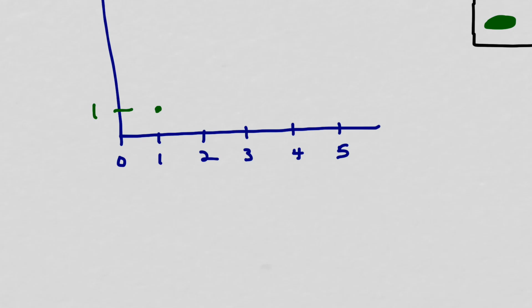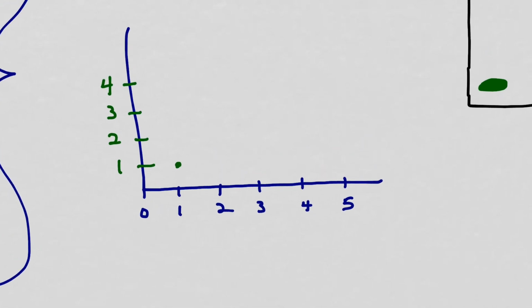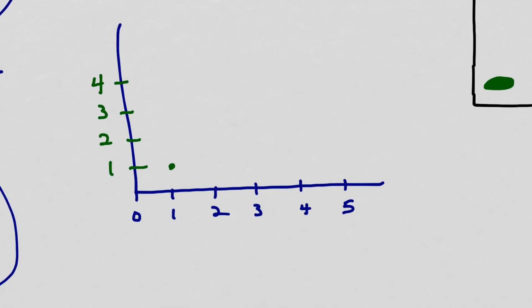Okay, so you do that in your data table. If, let's say, you had 3 disks that rose between the first minute and the second minute, what we'd need is some more values here, 2, 3, 4, and what we would do here is create a data table first, where if we had 3 disks that rose between the first minute and the second minute, what would that give us? That would give us a total of 4 disks at the second minute. So what you're going to do is take your data table, and I'm going to make one up here so you can see what I'm talking about.